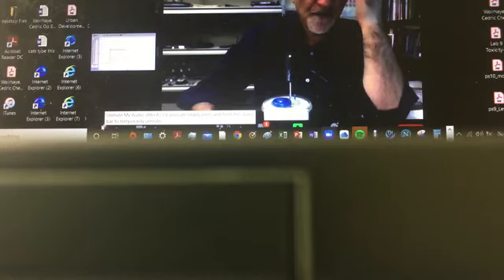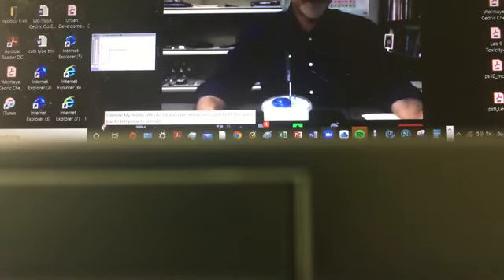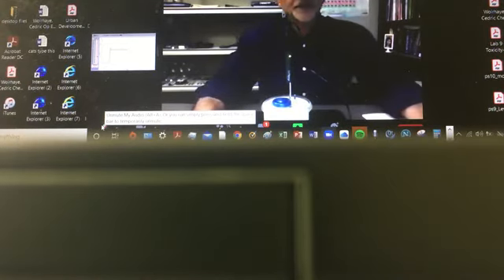So it's going to take a while. I'm going to give it a chance of 10 minutes or so, 15 minutes to cool down a little bit. Right now it's not giving me any sense that it's going to go down, but let's see if it's going to go down a little bit.